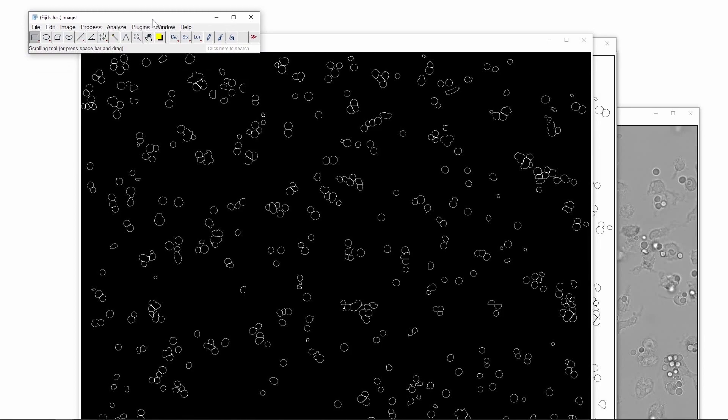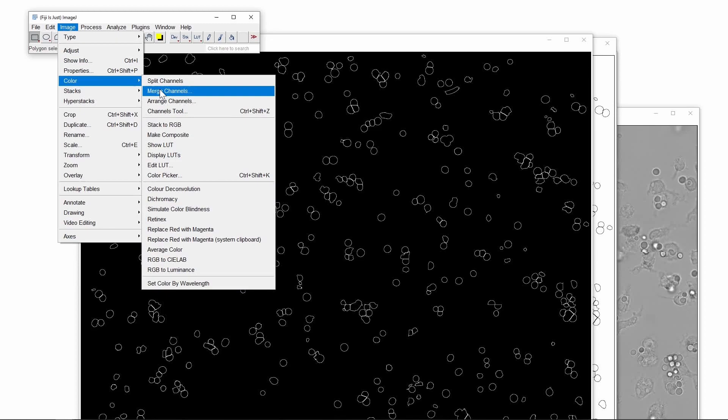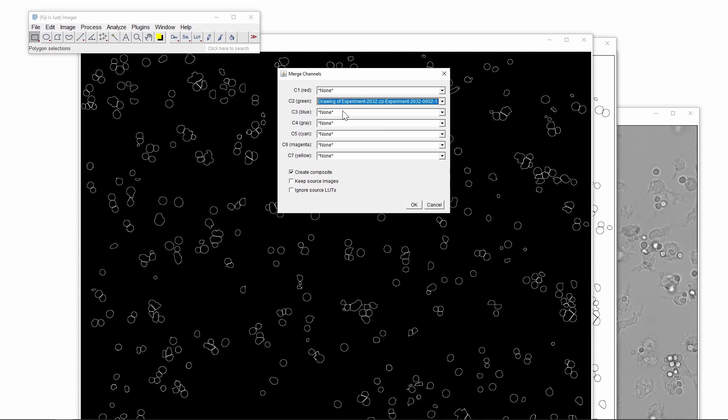This image contains the outline of each spore. We can use it to create an overlay. The image will then be inverted first, and then we use the merge channel command to generate the overlay image. Here we will select the gray image to be the original one, and the green image to be the outline created with the particle finder. And now we have the transmitted light image with the spores outlined in green.